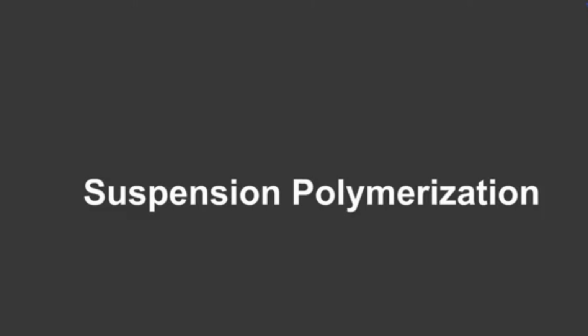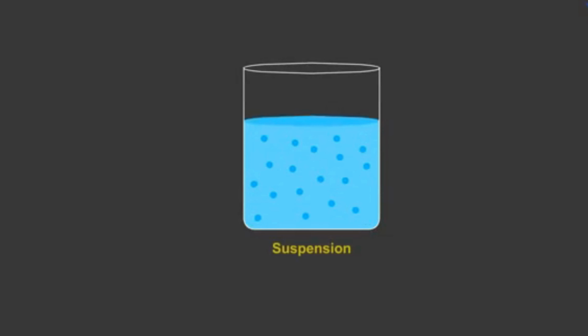Preparation of resin beads. Polymerization. Historically, polymer bead production is by suspension polymerization in a stirred reactor.